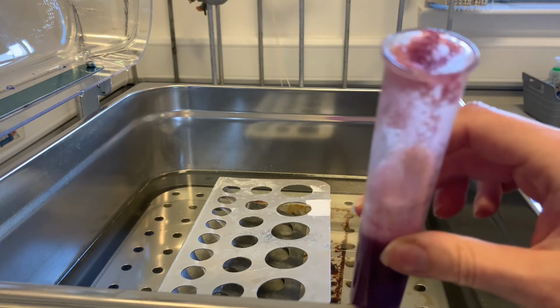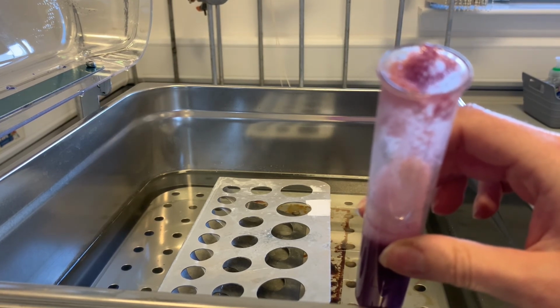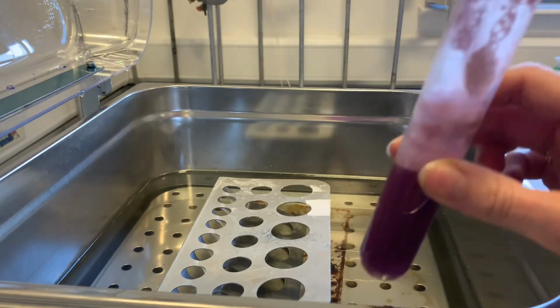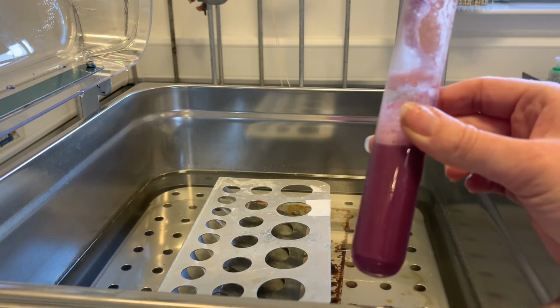So yeast, if they feed on sugar in the absence of oxygen, will carry out the process of fermentation, and they will produce carbon dioxide gas, which has been collected there in the balloon. And we can also start to smell the alcohol that is present as well.